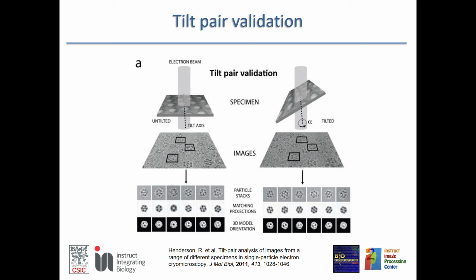These flipped images are obtained by putting the projection in the opposite direction from the correct one. So there is no way from the image processing to tell which one of the two, the mirror or the unmirrored structure, is the correct one.